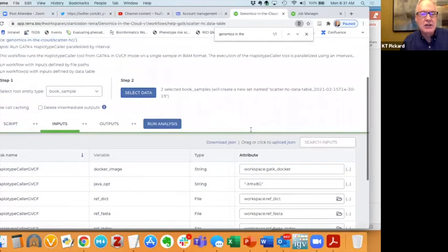And the advantage here is that if you needed to make a change to your overall GATK Docker image, you could change that at a higher level, and then your sample sets would use the attribute in the workspace, rather than having to go through and change a bunch of different files. You can do it at a higher level, and those then cascade down using this workspace concept.